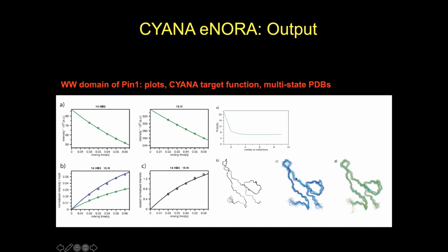Typically here in the beta sheet region, you really see that each structure calculation produces one state further up here that is shown in cyan and the other one in blue. Then here is another example when you run 3 states, also sorted by the states. Well, that's what I wanted to show in terms of software.